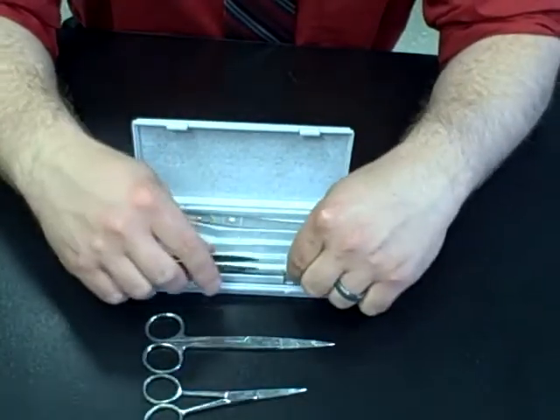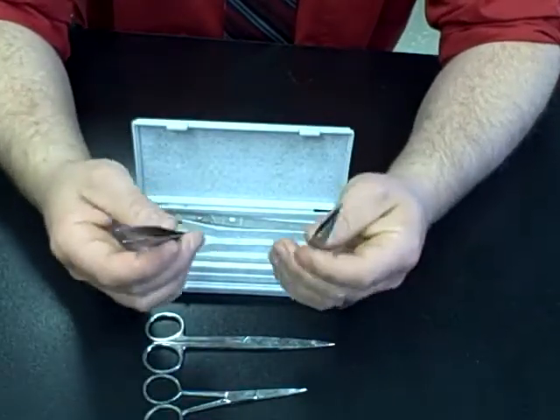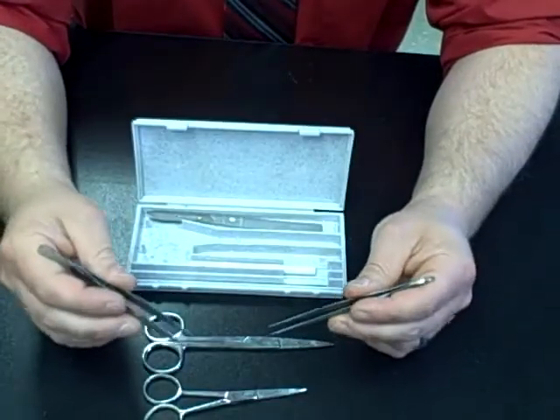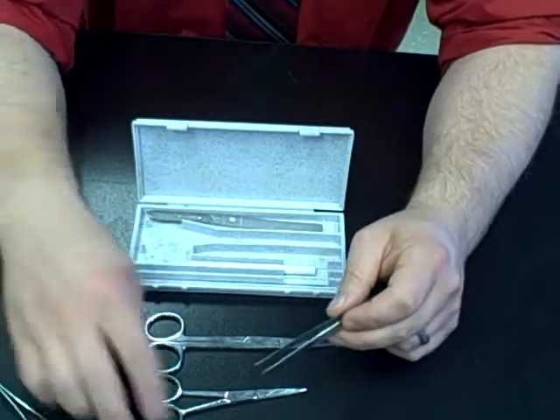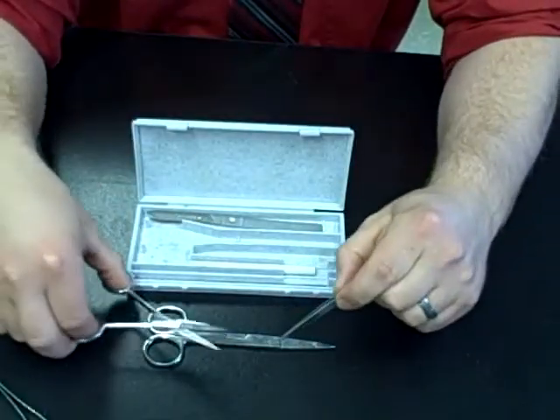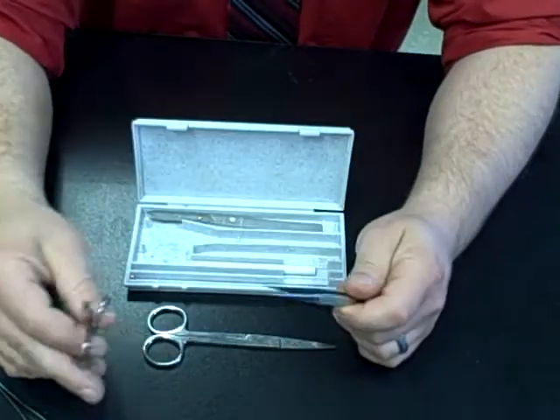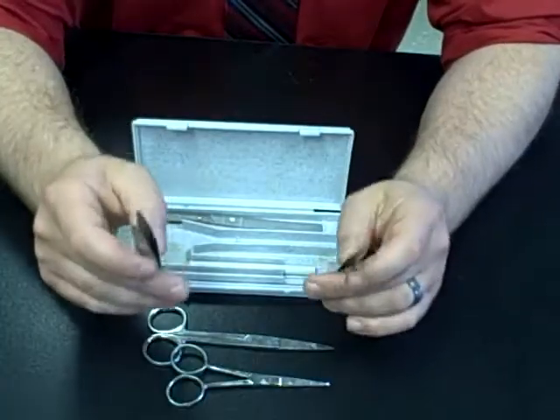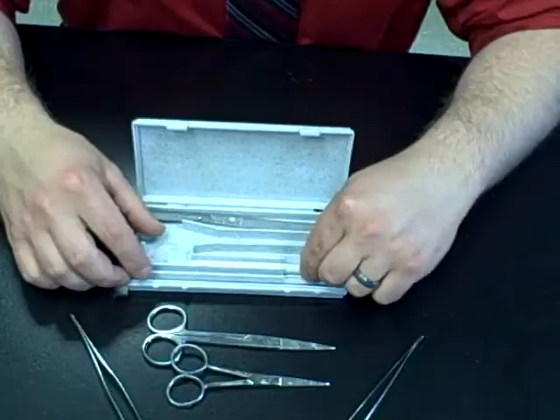All of your dissecting kits have two pairs of tweezers. Some of them will be curved, others will be straight. This is helpful because you can have multiple people in your group helping you — as long as they have the tweezers, you're not really going to get in each other's way. This is also helpful if you need to hold some tissue while someone else is cutting. You should never have your hands near anything being used to cut — whether scissors or the scalpel. You always use the tweezers to hold things. That's why each kit has two.